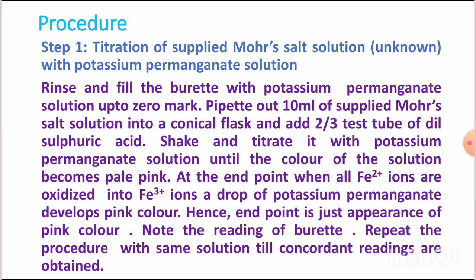At the end point, when all the ferrous ions are oxidized into ferric ions, a drop of potassium permanganate develops pink color. Hence, the end point is just the appearance of pink color. Note the reading of the burette. Repeat the procedure with the same solution till concordant readings are obtained.